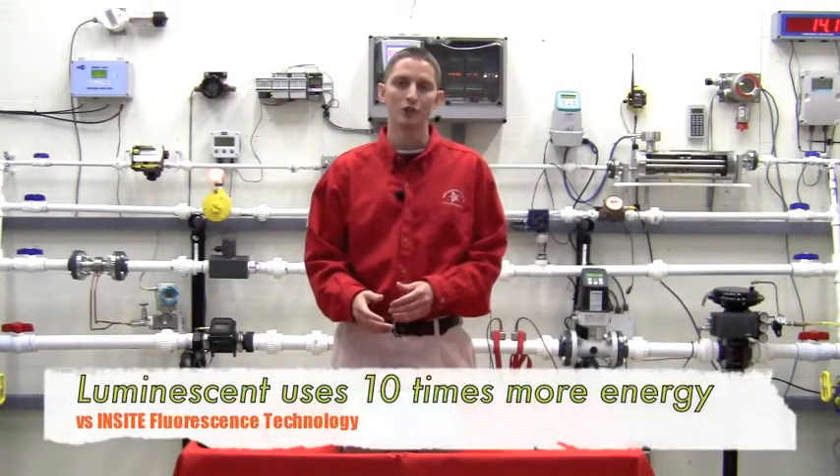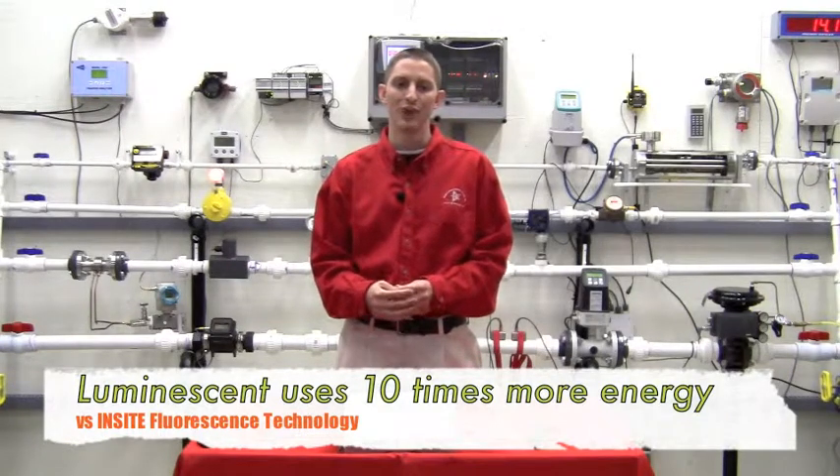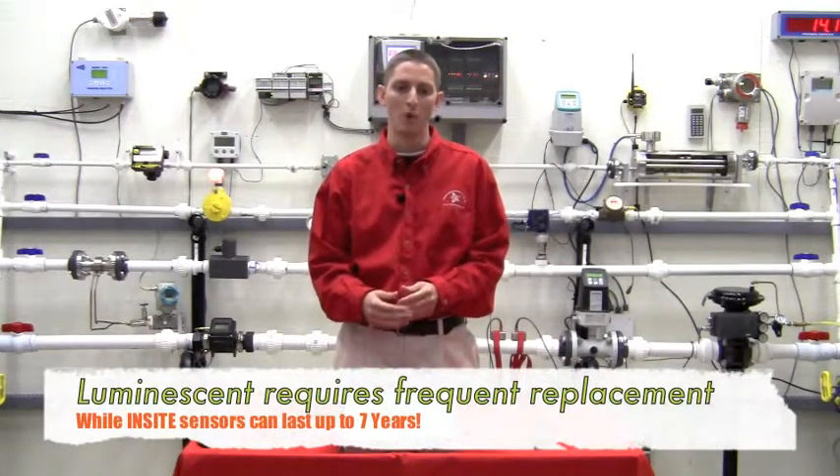The luminescent technology uses 10 times the energy of INSITE's technology, which allows our sensors to last on average seven to ten years compared to most luminescent sensors lasting an average of one year.